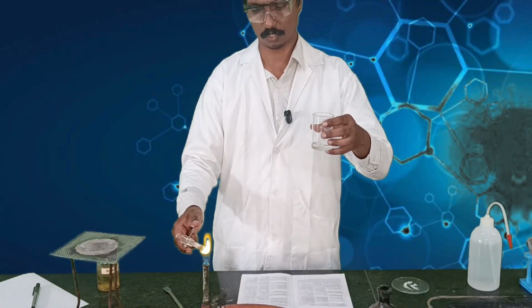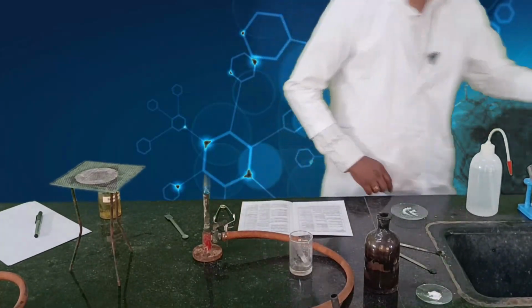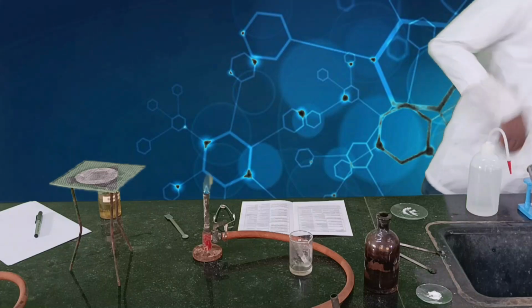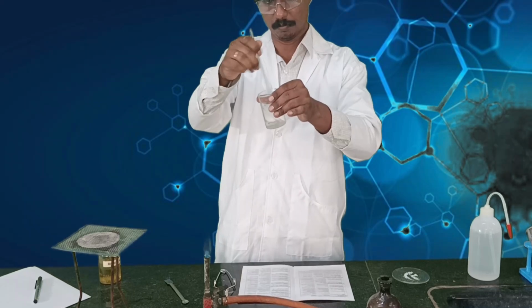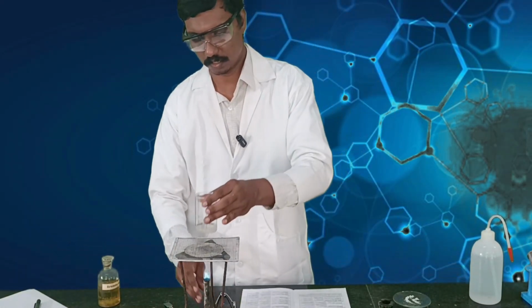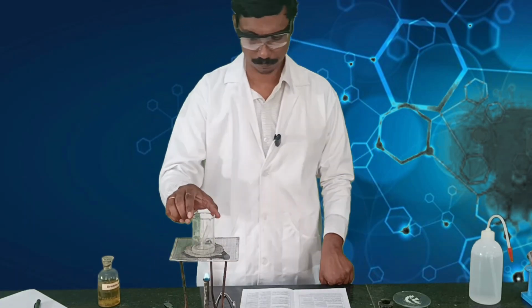a beaker which contains about 10 to 15 ml of water, and you have to break this test tube. You take a glass rod and you break this fusion tube, mix it well, and then heat this mixture for about 30 seconds or so.